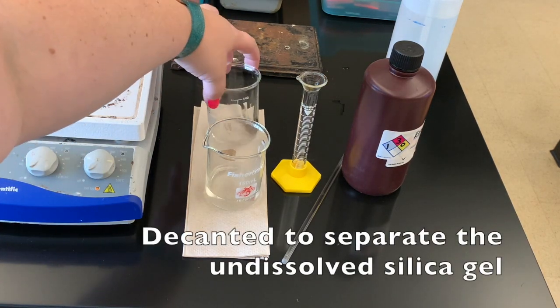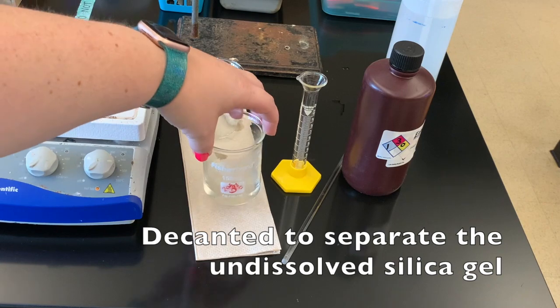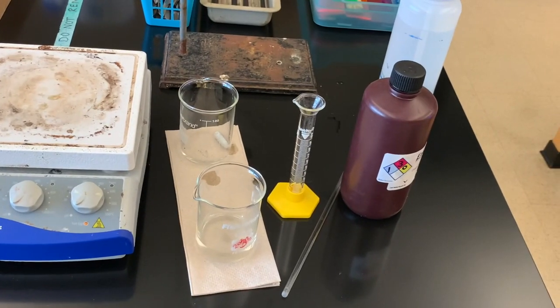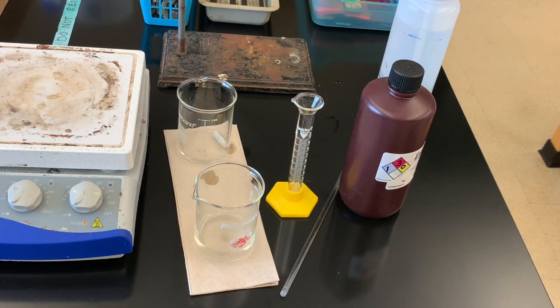I've also decanted the water glass into another beaker to get rid of any undissolved silica gel that's still left. To this, we're going to add five milliliters of 95% ethanol and then stir with a stirring rod until it becomes a solid. Then we're going to try to make a ball and see its properties. So I'm measuring out five milliliters of ethanol with a bottle of ethanol and a graduated cylinder.